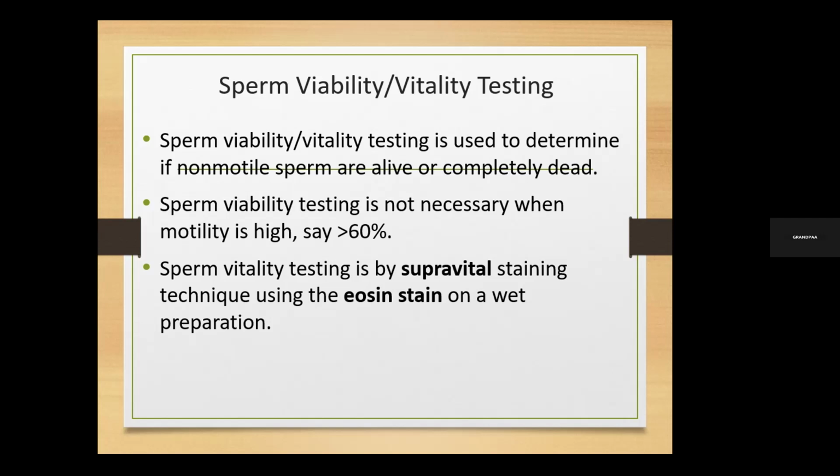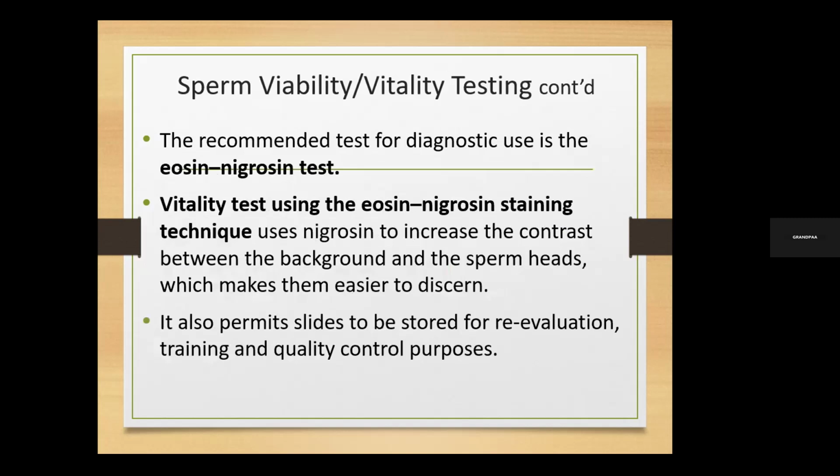But there's another modification where a stain called nigrosin has been added to the eosin. And that becomes the eosin-nigrosin test. So it is now recommended that you use eosin-nigrosin. Now the main stain doing the actual staining is the eosin. So the nigrosin comes in as a counterstain.